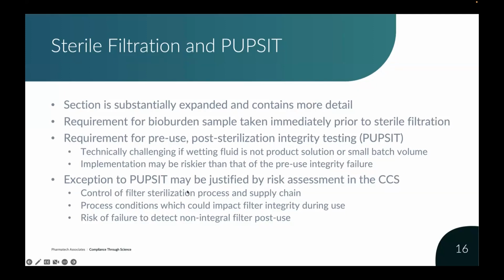If you're simply buying a gamma irradiated filter and it's just being shipped to you, you really don't have a lot of control over the shipping conditions in which you're receiving it. And so, are you concerned that that filter could have been damaged, even though you're relying on an integrity test that was done prior to that, and the overall supply chain?